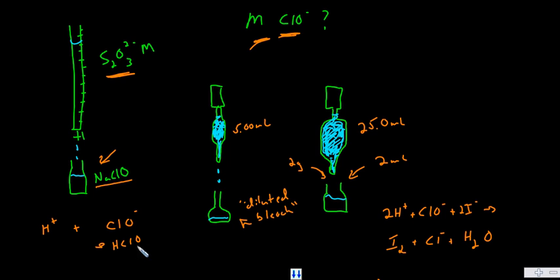However, you cannot do this, because if you form this compound, you're also going to be at the same time forming chlorine gas, which is toxic.